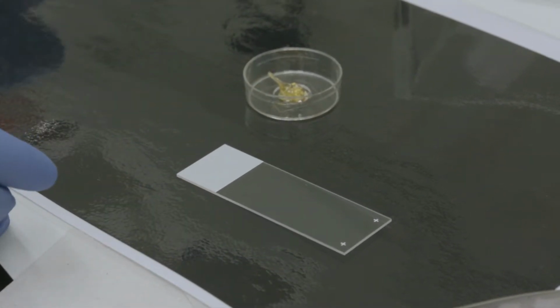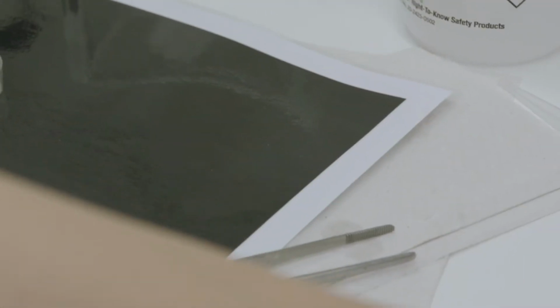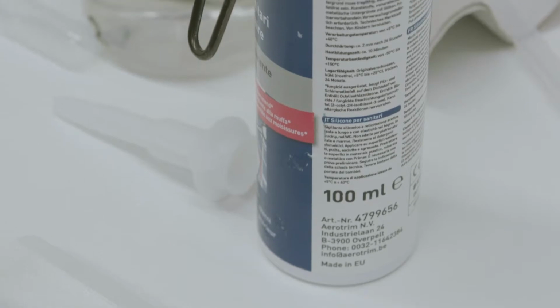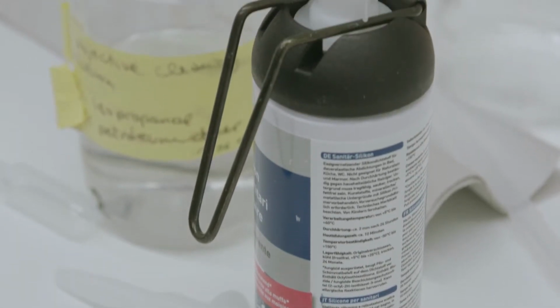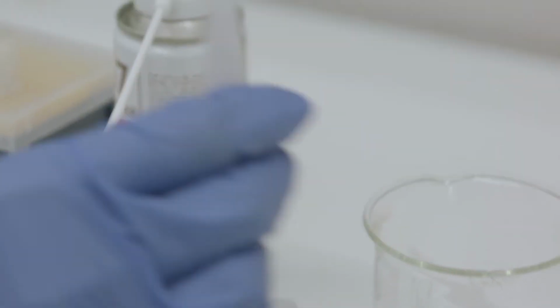We came up with a solution of using silicone gel. As I said before, the gel used to seal the bathroom sink. Normal gel. With this, there is a tip that you can put on it, like this.